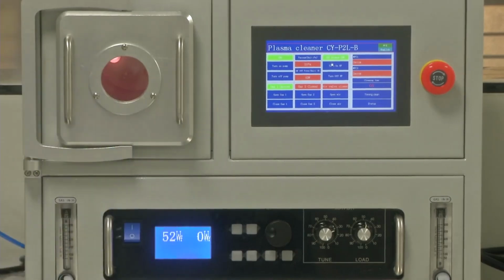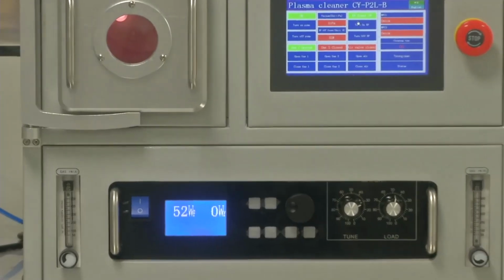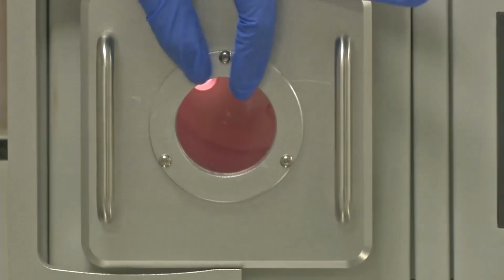You can go up to 150 watt power, but that is not really necessary for our operation. This plasma is enough to etch the surface or clean the surface. So I think you can clearly see the plasma inside, pink color.